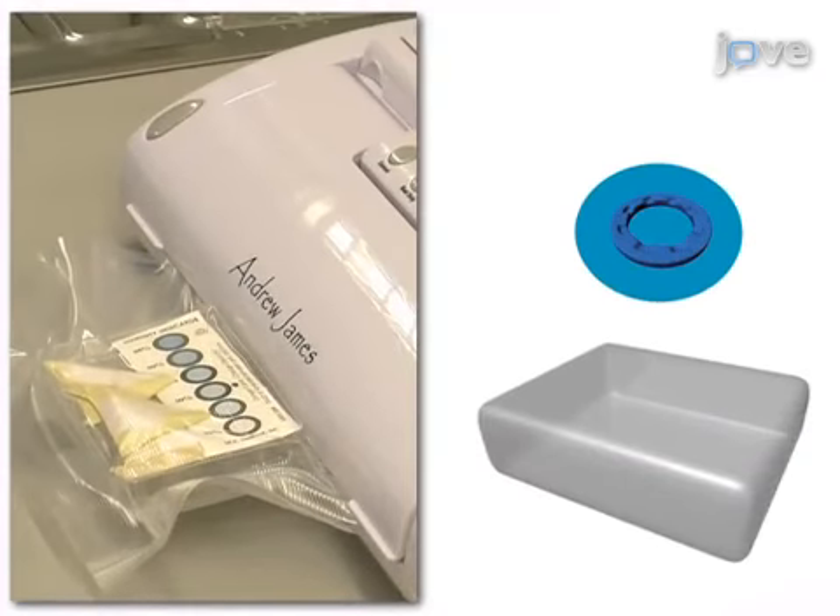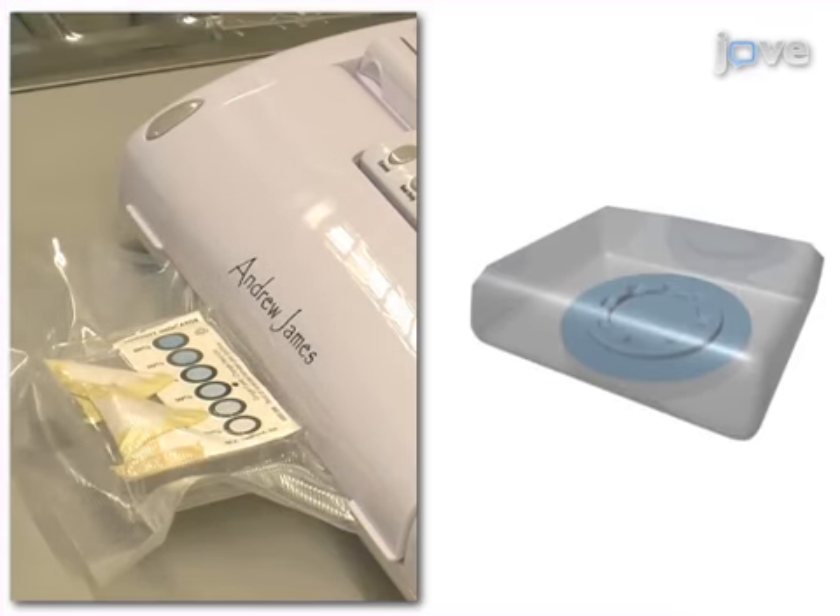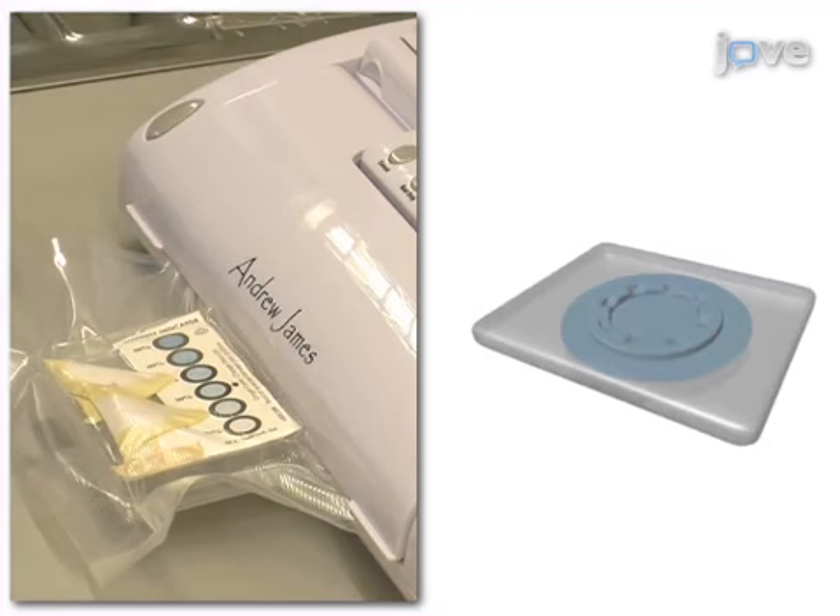Next, packaging procedures and degradation of the electrospun membranes are studied. Premature degradation of the stored membranes is avoided by controlling temperature and moisture.